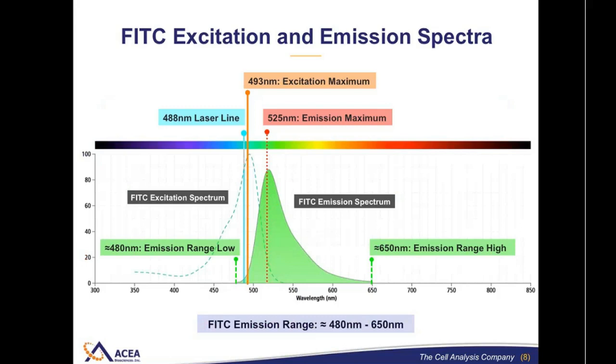In a traditional flow cytometer, we have to choose a filter set to select some of the emitted fluorescence of a given fluorochrome to be collected in a detector. And ideally, the maximum emission of the fluorochrome would be included in that filter set. It would be way too restrictive to use a filter set that would collect all of the emitted fluorescence from each fluorochrome. So in addition to giving some thought to what light our filter set choices will collect, we also need to give some thought to the entire range of the emission spectrum, particularly that light which is not collected in the intended detector.